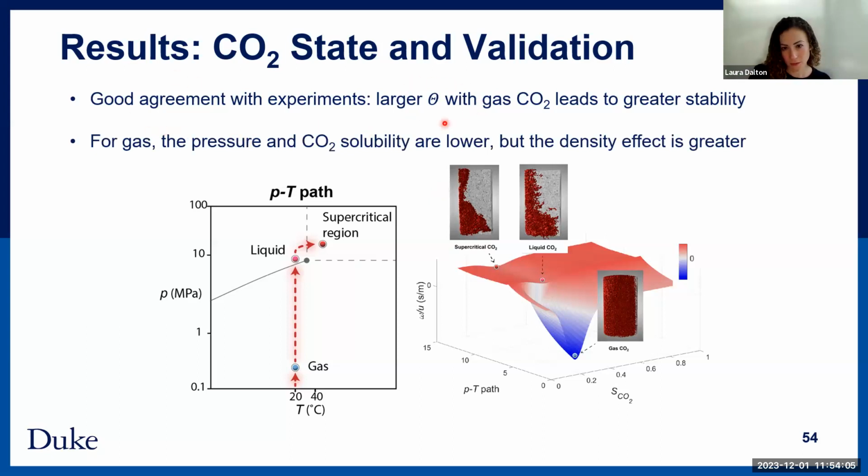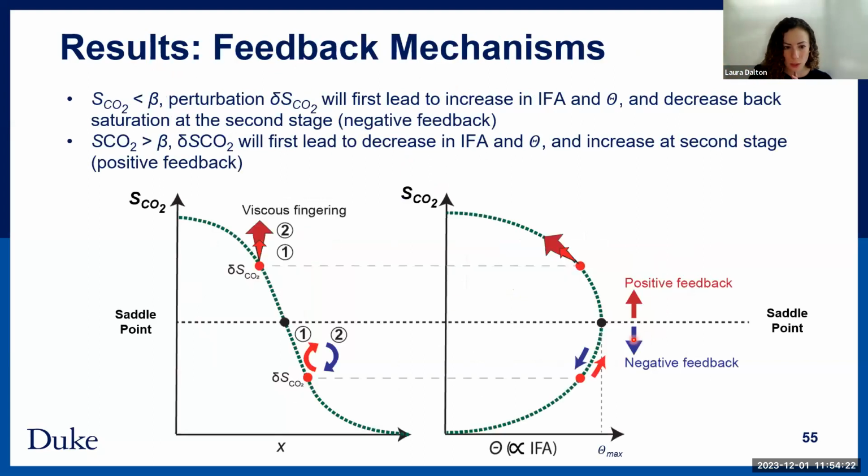Basically you have this larger interfacial area between the CO2 that's entering the system and the amount of water that's already in the system. And as that changes, we're able to really make sense of what we were observing. But this is still a work in progress.